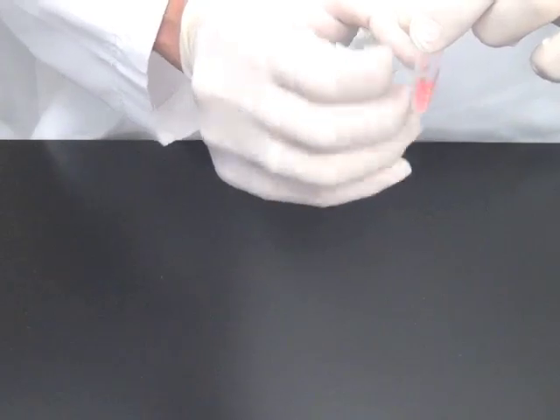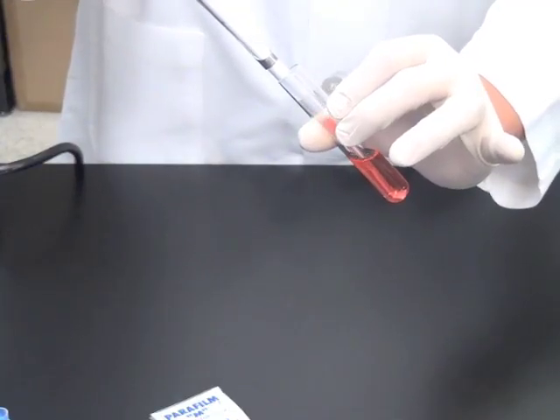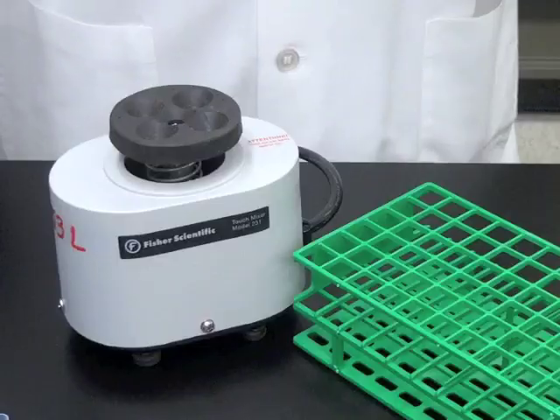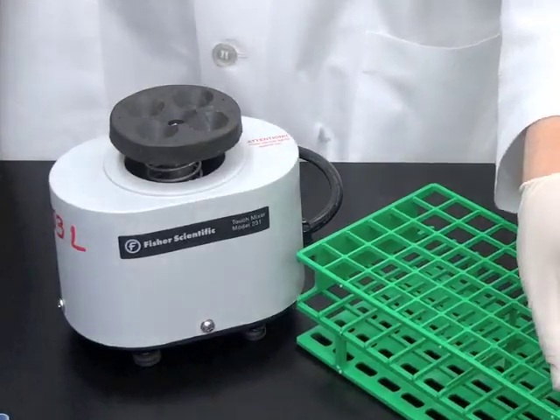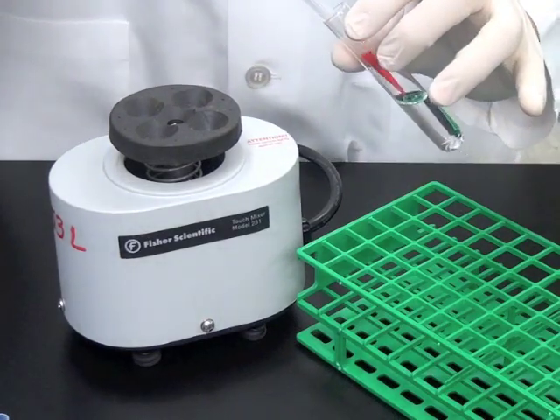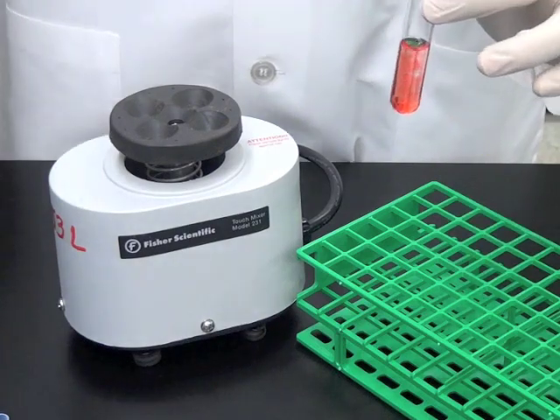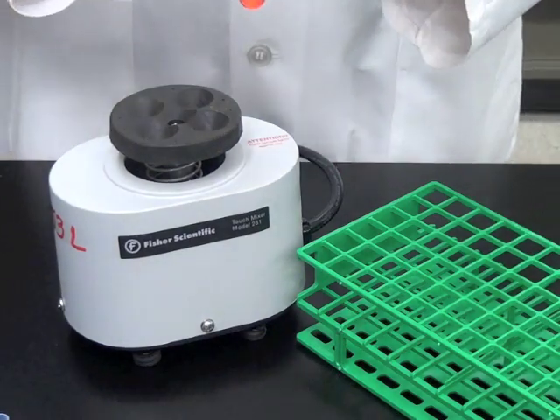So long as you perfect your mixing technique and mix all solutions for a particular experiment systematically, then any breakdown of the solute will be systematic for each sample, which can effectively be ignored. Thus vortexing is generally the favorite method and should be used for every sample unless otherwise instructed. Since you are all assumed to be beginners in mixing solutions, be sure to include the vortexing step in all your protocols.